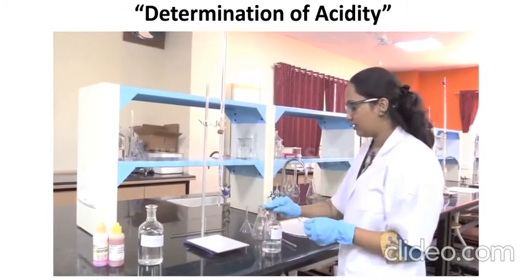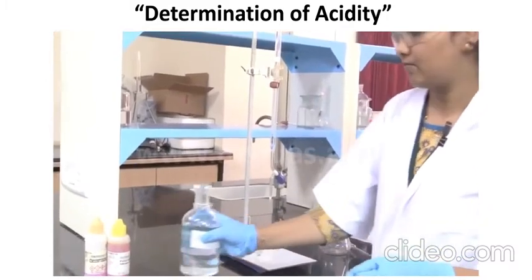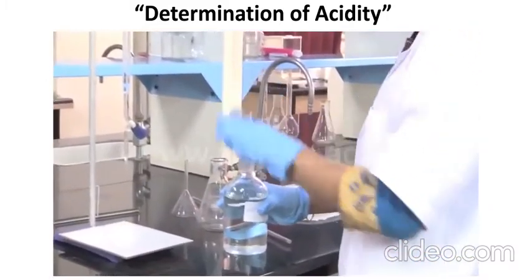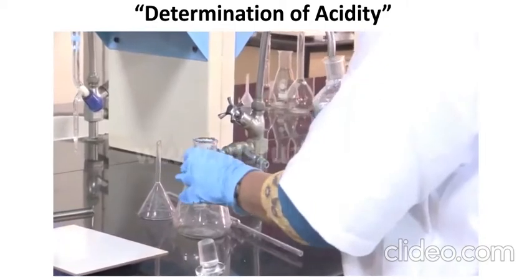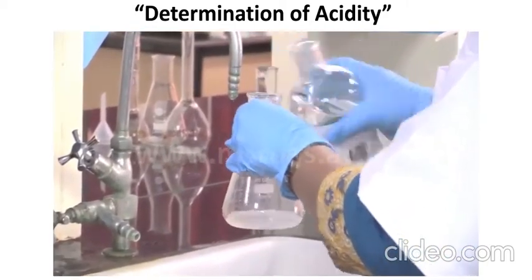Now we need to take the water sample in the conical flask. Before that, we need to rinse the conical flask with some quantity of water sample.